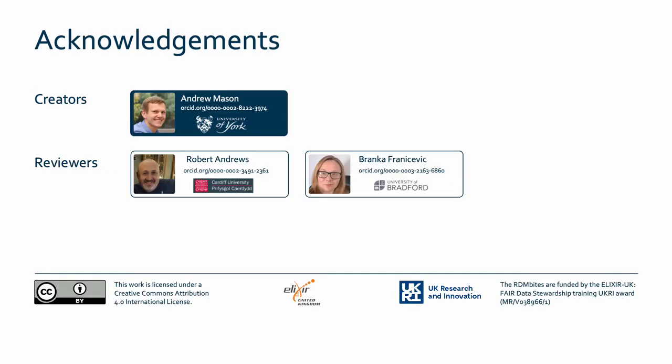That concludes our initial look at assessing sequencing data quality. Take a look at the links associated with this video for more information, and the following RDMbites on FastQC metrics and read trimming.